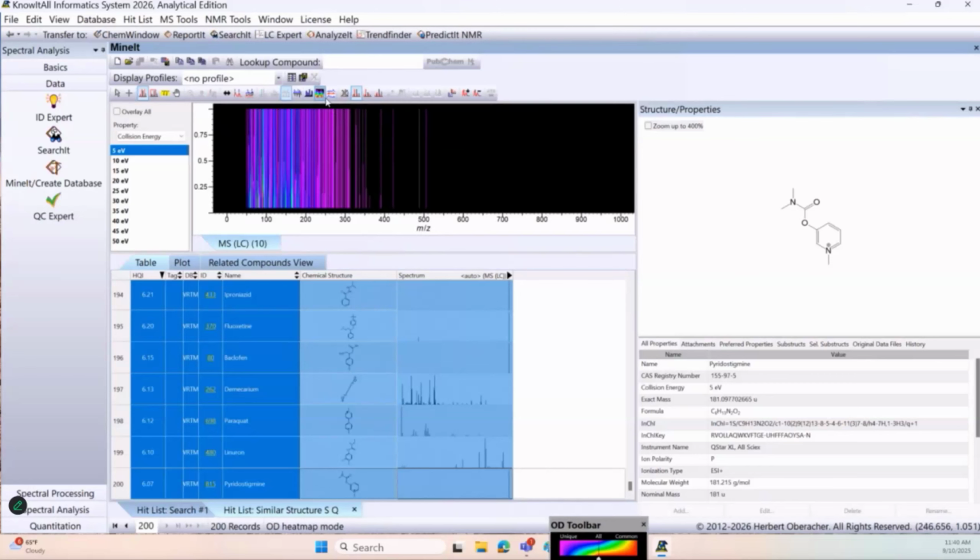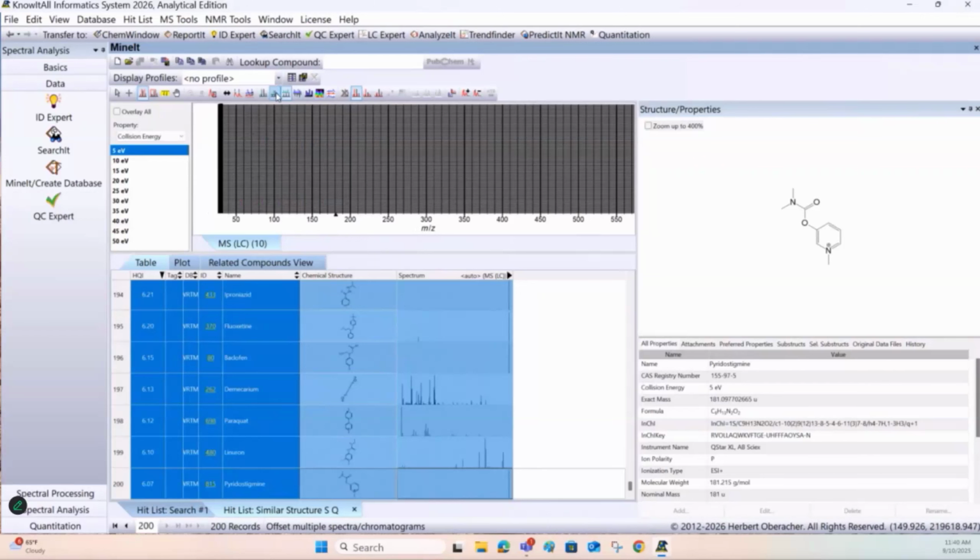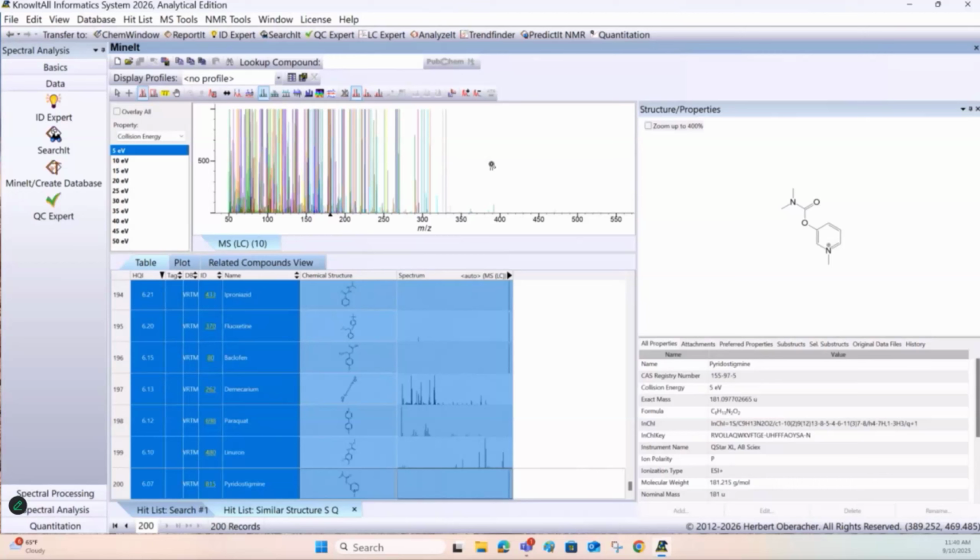Okay, you can use the heat map to look at them. No heat map. This is too many. It's because of overlapping. I'm going to reduce it. Okay, you can see a bar chart here. It doesn't make any sense. You can't make out what this data set is trying to tell you, right?